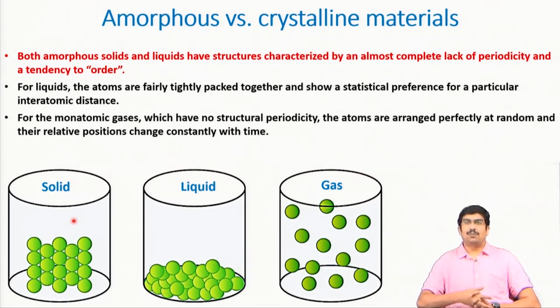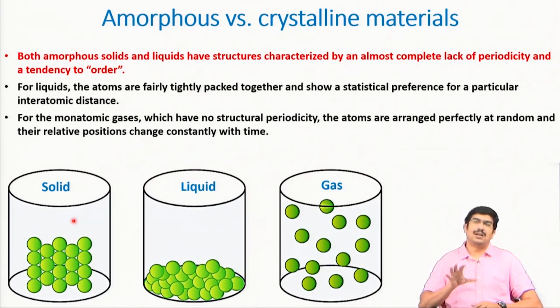Okay. So that is what strain is doing. We will be discussing one last effect, which again will change the X-ray diffraction peak. So this is basically amorphous versus crystalline material, about the structure or the atomic arrangement within the material. We have discussed a little bit of that when we were discussing Bragg's law. We discussed how crystalline periodic arrangement is finally responsible for getting the constructive interference and so forth.